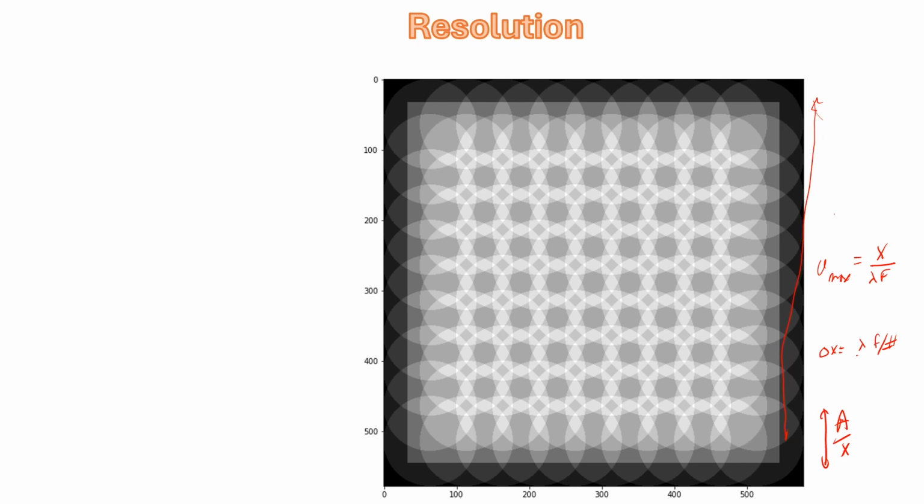There are other ways to do phase retrieval, as we've seen, but the nice thing about Fourier ptychography is, first of all, that the reconstruction algorithm is much more robust than if we had tried to do the full-scale aperture. People have used Fourier ptychography to recover gigapixel scale images, but in processing gigapixel scale images, the individual steps in the error reduction algorithm may require only working with megapixel scale images, and you just use several hundred or even thousand megapixel scale images, and you can recover a gigapixel image where any of the Fourier transforms that you're taking are all going to be on that megapixel scale.